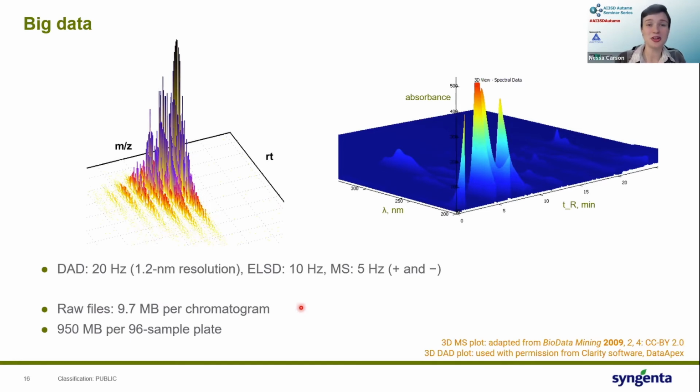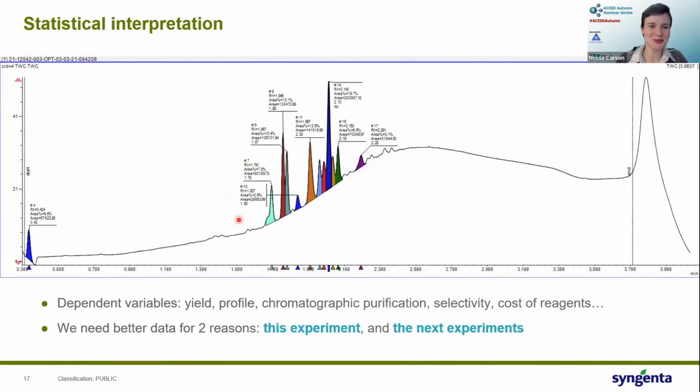And when I was talking about this with my biomedical friends, he was really surprised to know that actually our data are so complex in chemistry and in high throughput chemistry that we need to come in as humans and distill them down from these big complex graphs. And we as experts need to come in and say to the computer, actually, this means that it's 57% yield in this particular reaction. We need to tell the computer what's important. I'm sure anyone who works in machine learning, or in the IT and chemoinformatics side, probably knows more about this than I do in a way.